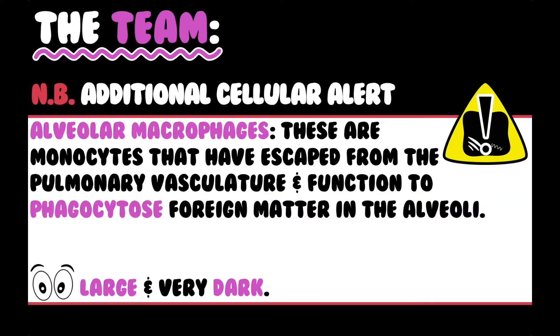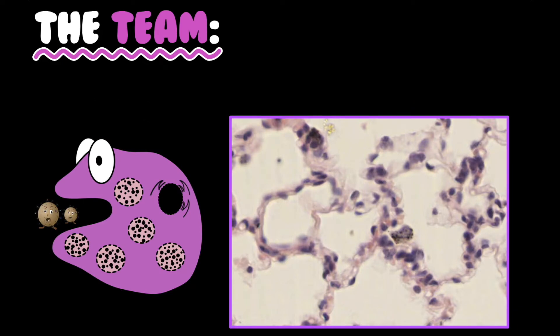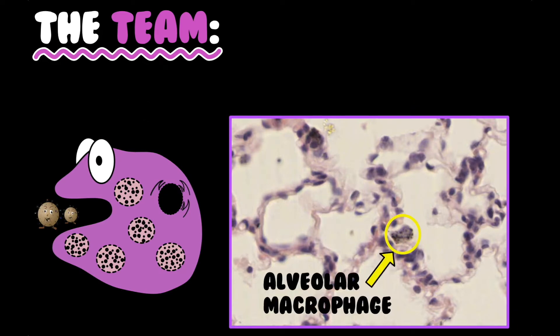Additional cellular alert: alveolar macrophages. These are monocytes that have escaped from the pulmonary vasculature and function to phagocytose foreign matter in the alveoli. They are very large and dark, as you can see from this singular alveolar macrophage.